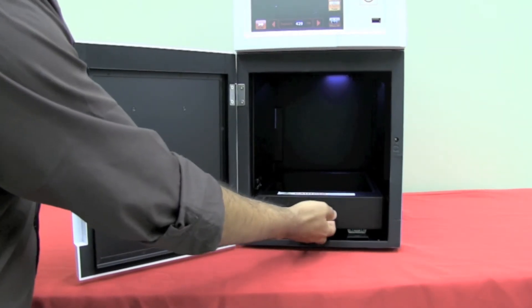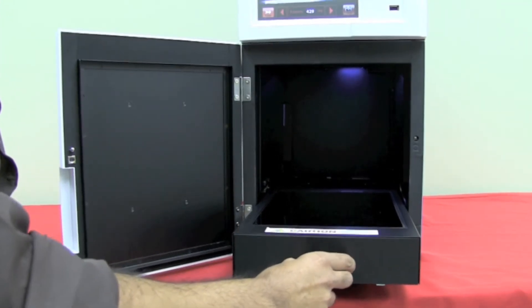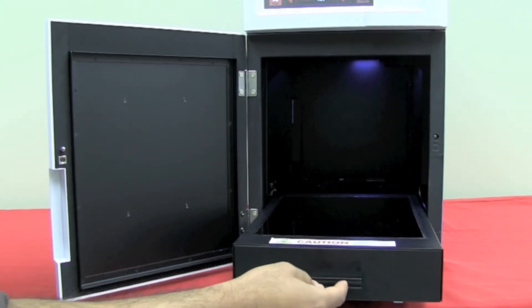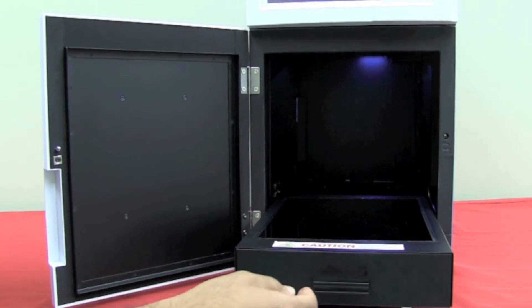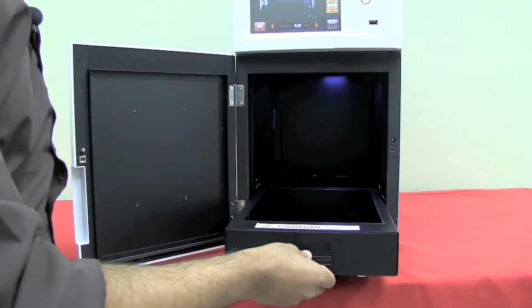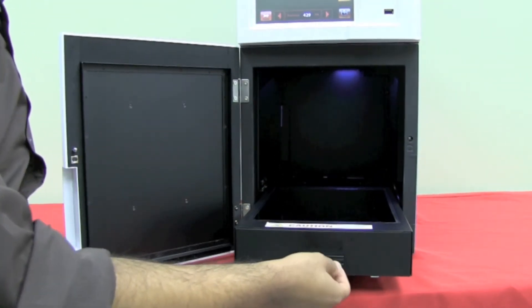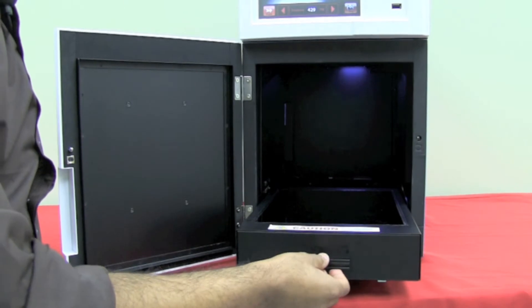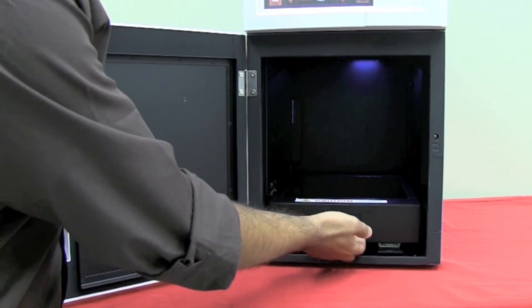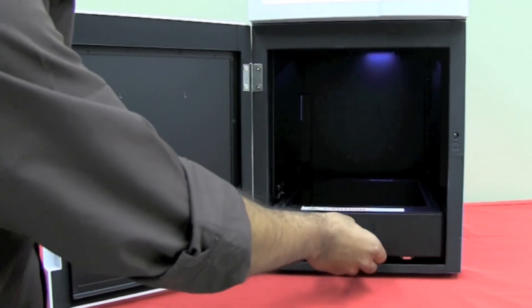The transluminator, looking at it in a little more detail, you can see it's mounted on a set of rollers. It's designed to allow for the excitation of multiple fluorescent dyes to occur at any given time. There's also a UV light in here that will only turn on when the door is actually closed — this is to protect the user. The manufacturer describes this as a smooth slide-in motion. Although this will suffice in your day-to-day activity, the slide-in motion doesn't seem as robust as the rest of the instrument — it does appear to be the weakest mechanical part.